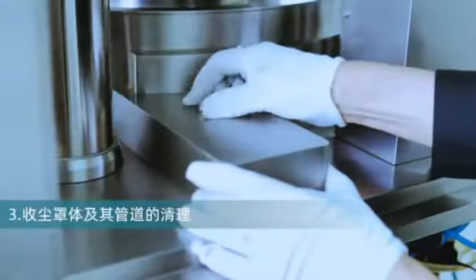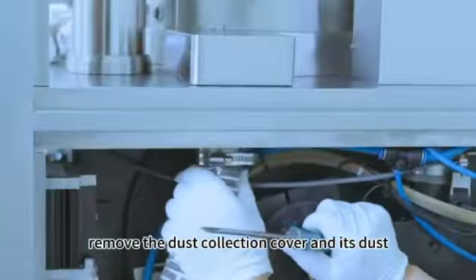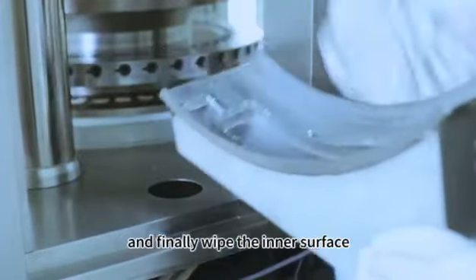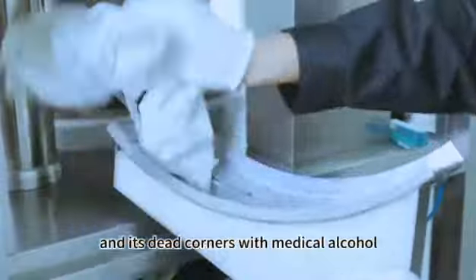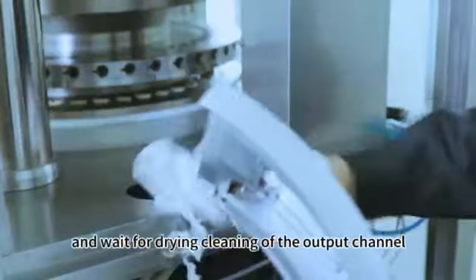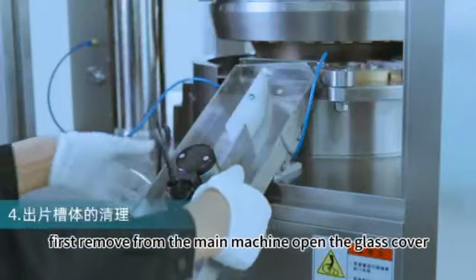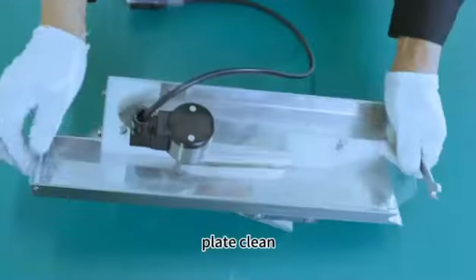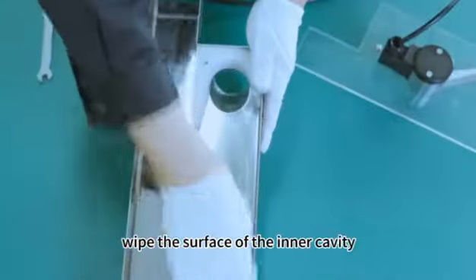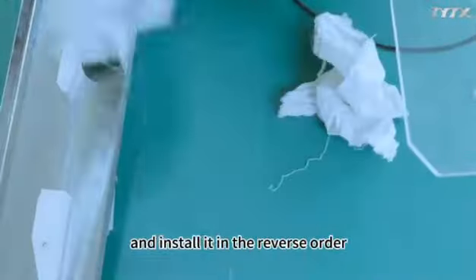Cleaning of the dust collection cover and pipes. First, remove the dust collection cover and its dust collection pipe. Wipe the inner surface of the cover with a clean cloth, and finally wipe the inner surface and its dead corners with medical alcohol. Rinse the dust collection pipe with clean water and wait for drying. Cleaning of the output channel. First, remove it from the main machine, open the glass cover plate, clean and wipe the inner cavity, and finally wipe the surface of the inner cavity and its dead corners with medical alcohol, and install it in reverse order.